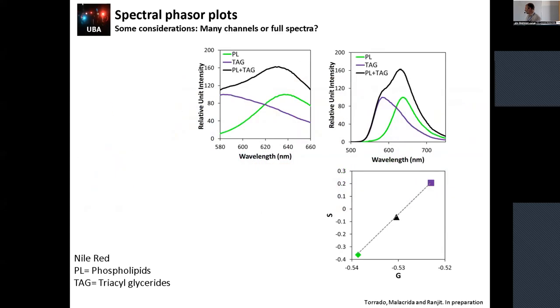So the last thing that I want to mention is the other problem if you want to go with high resolution or go fast and chop the phasor, so the total hyperspectral collection. If you chop one side or the other of your data, then you will not be able to claim the linear combination properties. So this is to explain one day to someone what could happen with this.